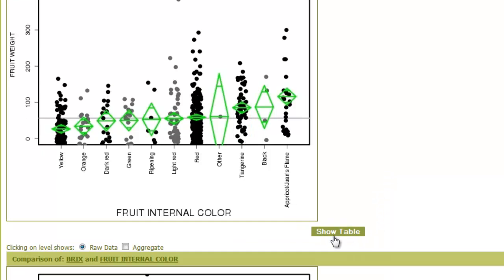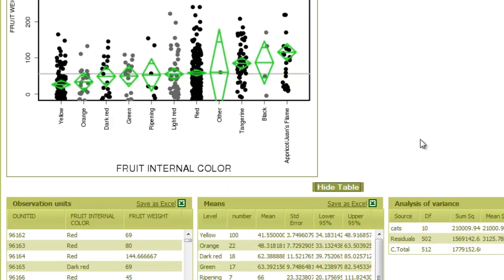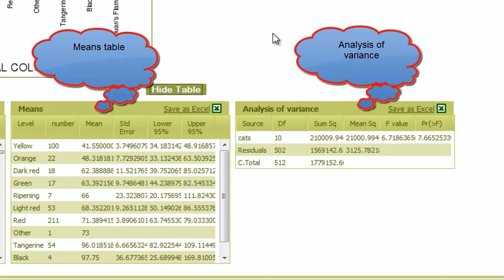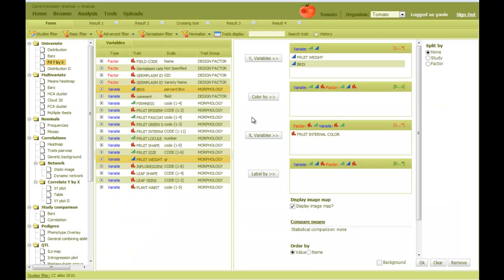Clicking on the show table will display three tables. The first is the raw data. The second is the means and other statistics about the X category. And the third is the analysis of variance table. These tables can be downloaded as shown.